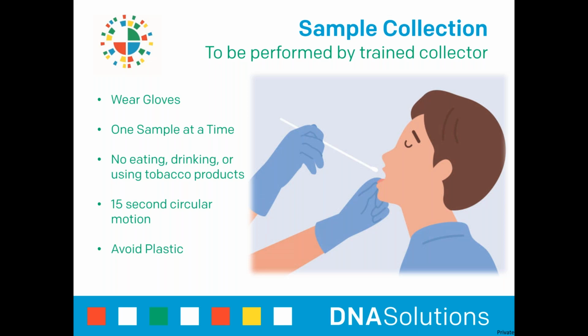Following a simple technique and guideline when collecting a sample can help prevent contamination, mixtures, partial profiles, degraded DNA, and sample swaps. As we dive deeper into some of these tips and tricks, we will discuss the importance of wearing gloves, obtaining one sample at a time, making sure the testing parties do not eat, drink, or use tobacco products before a collection, as well as the amount of time a sample should be collected, and one very important rule, avoiding plastic.